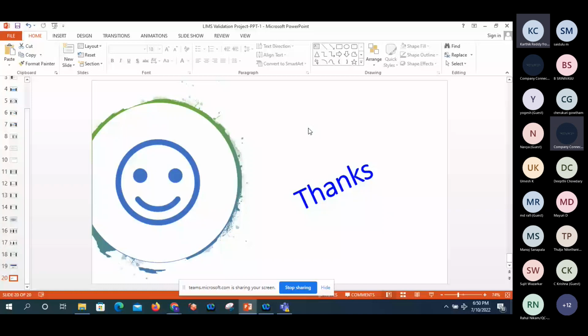Then we move the same thing to the quality environment, where we can test easily. After that, we move to the production environment. So module-wise, we can deliver to the end user, and the people can adapt easily.